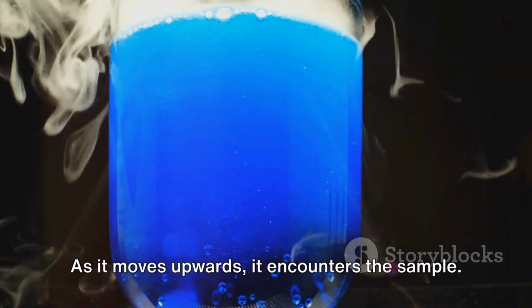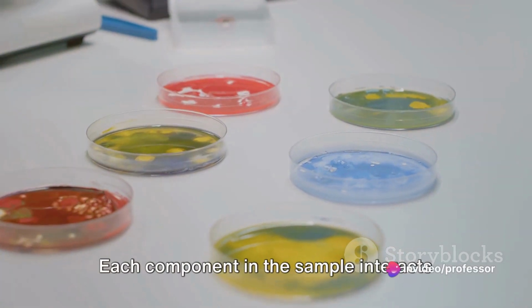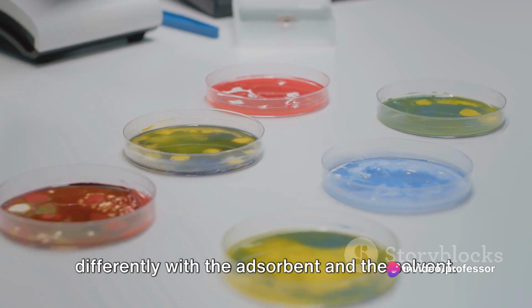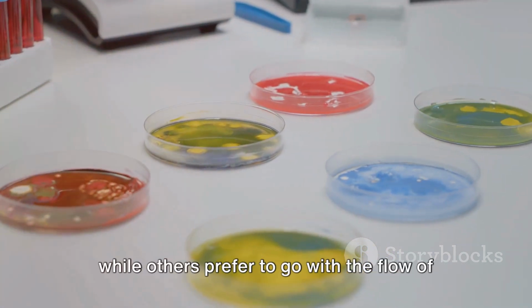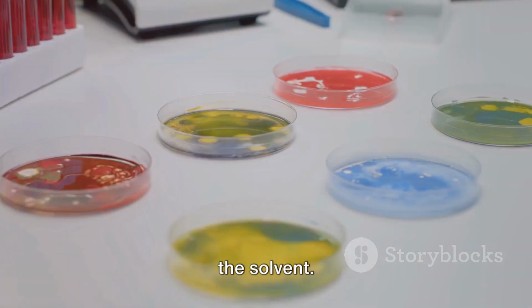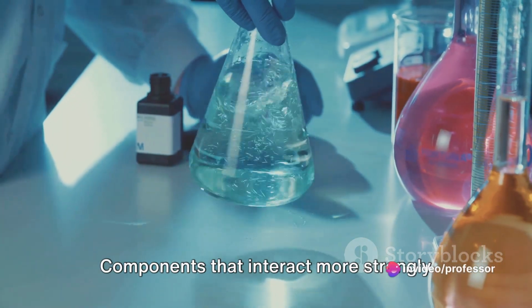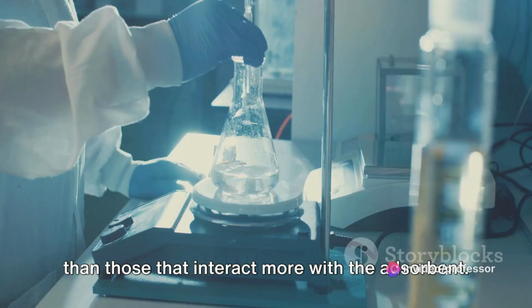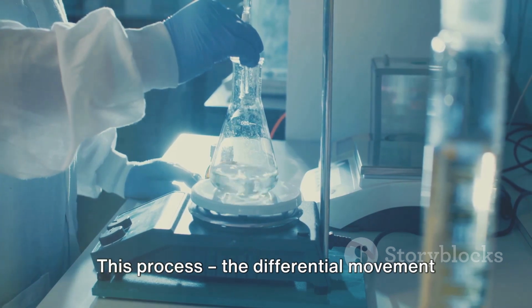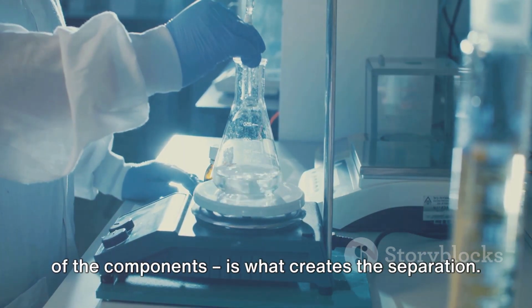As it moves upwards, it encounters the sample. Here's where the fun begins. Each component in the sample interacts differently with the adsorbent and the solvent. Some components stick to the adsorbent, while others prefer to go with the flow of the solvent. This creates a beautiful dance of separation. Components that interact more strongly with the solvent move up the plate faster than those that interact more with the adsorbent. This process, the differential movement of the components, is what creates the separation.